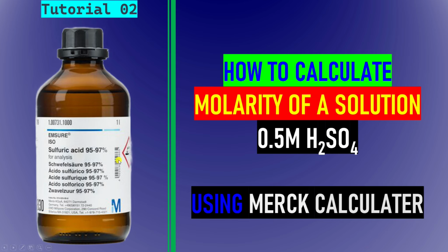In this tutorial I am going to teach you how to calculate the molarity of a solution using the Merck Calculator. In an earlier video I made a manual calculation of molarity of a solution. In this tutorial I am going to use this Merck Calculator. This is a very easy and simple way to calculate the molarity of the solution.